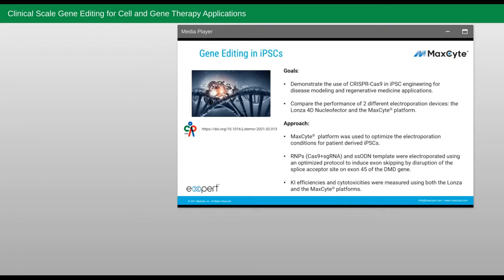The goals illustrated in this case study were to optimize the electroporation conditions in iPSCs for disease modeling. The Lonza electroporator and the MaxCyte platform were compared side by side in the disease modeling experiments outlined. CRISPR RNPs and an ssODN template targeting the Duchenne muscular dystrophy gene were electroporated into patient-derived iPSCs to induce exon skipping. Knock-in efficiencies and cytotoxicities were then assessed.